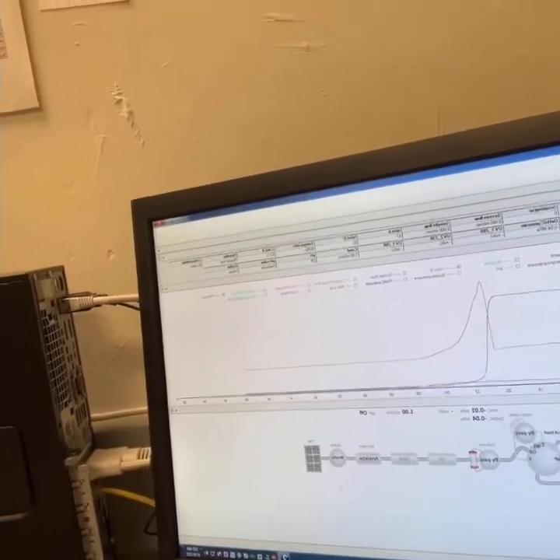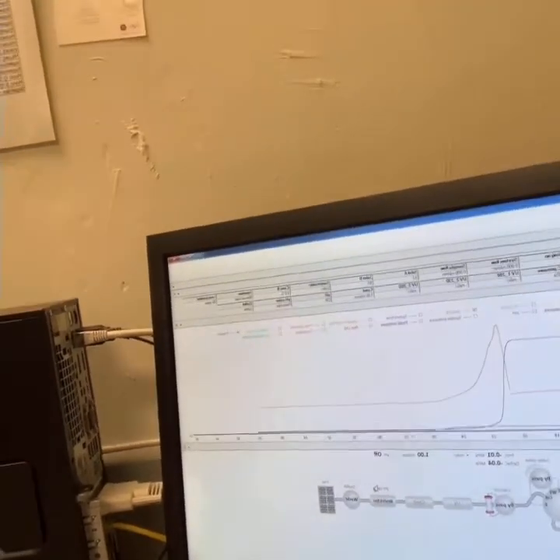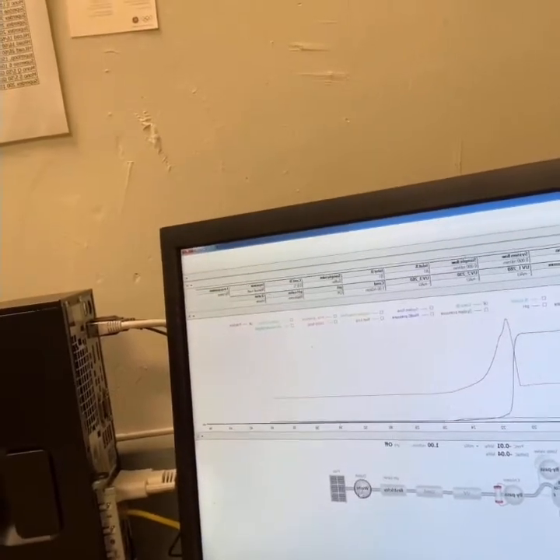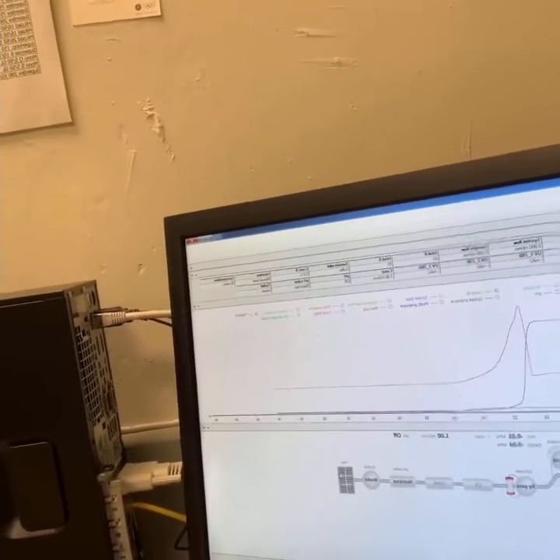Then it goes through a pH sensor and then the outlet. So right now it's just in this wash phase so it's going to the waste, but you can also set it to go to the fraction collector. So let's look at where these things are actually on the ÄKTA.